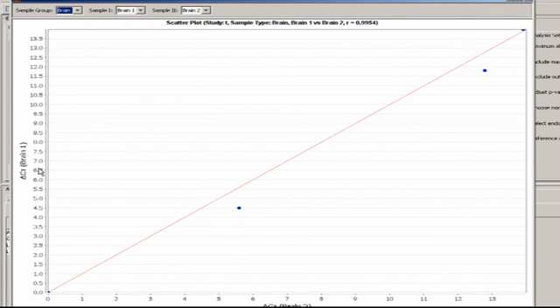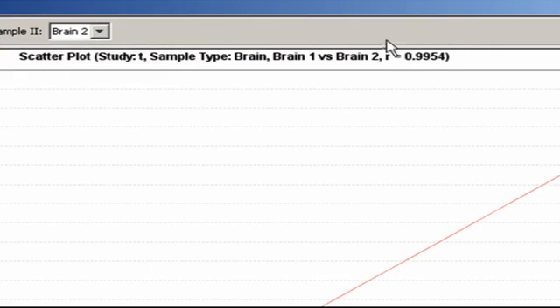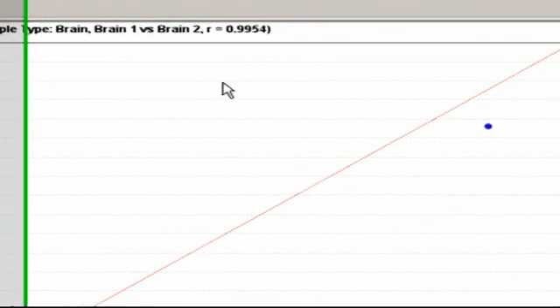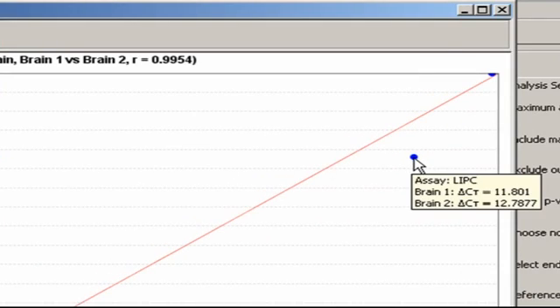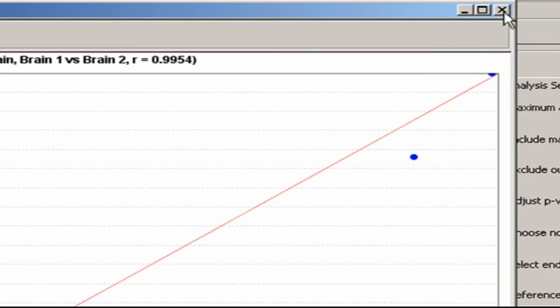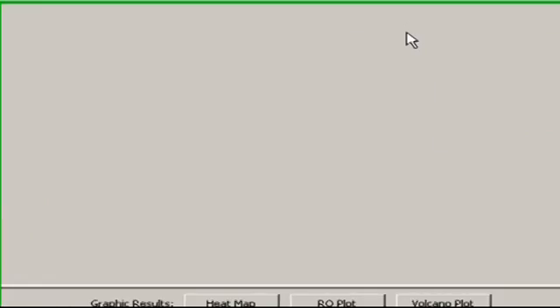And note, the Pearson's product-moment correlation coefficient is up at the top. Or, use your mouse to see the actual delta CT difference for a specific target gene. By the way, for stats fans, Pearson's product-moment is mathematically described in Appendix B of the user manual.